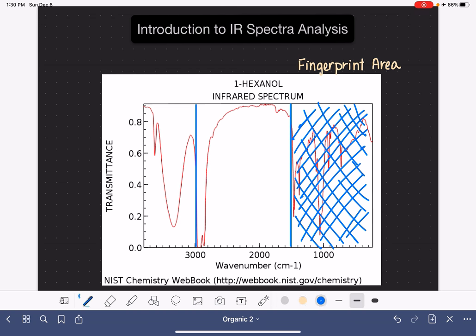This is the area that I like to call the area of special hydrogens. So we do want to pay attention to this area. We do not want to ignore it. This is the part of the spectrum where we are going to find hydrogens that are part of OH groups, hydrogens that are part of amines, terminal hydrogens in alkynes.